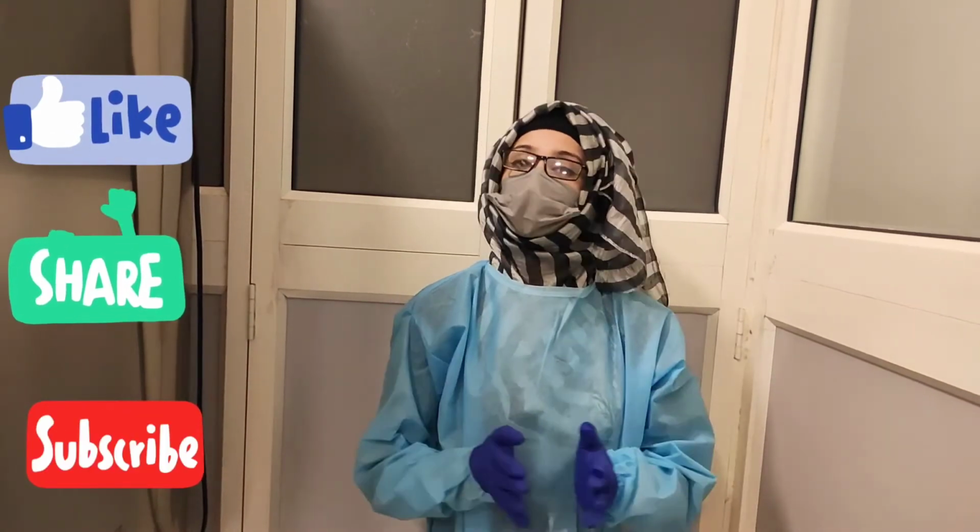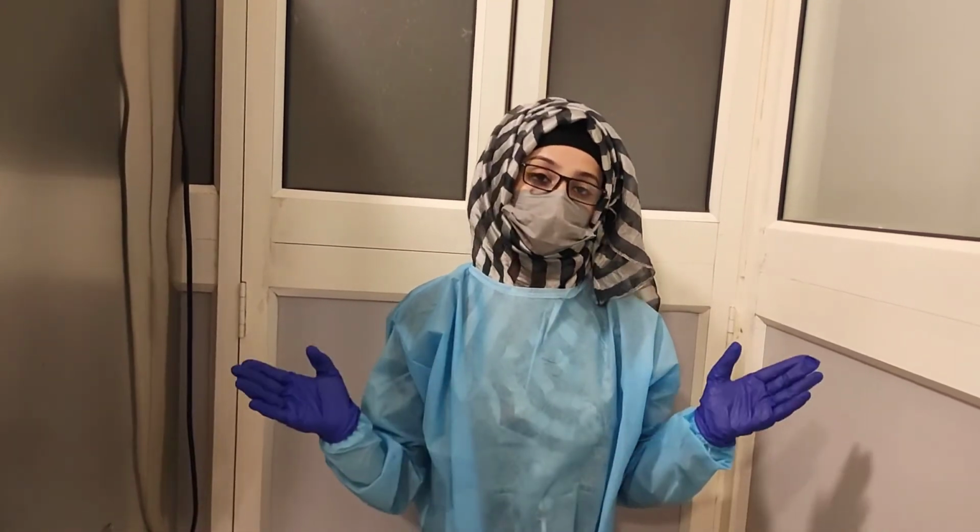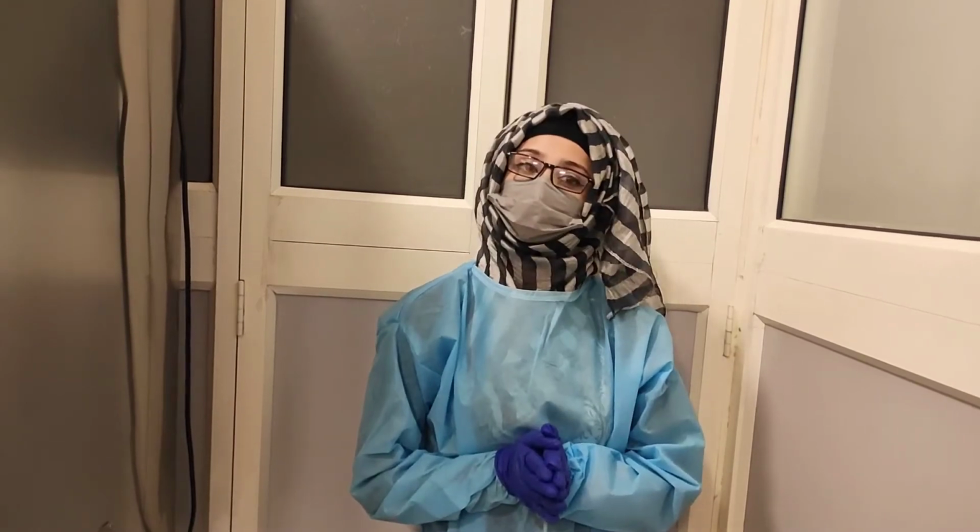Today I'll be demonstrating the RNA extraction of COVID-19 samples. This video is going to be in parts. This will be the first part of the video. So without wasting further time, let's get started.